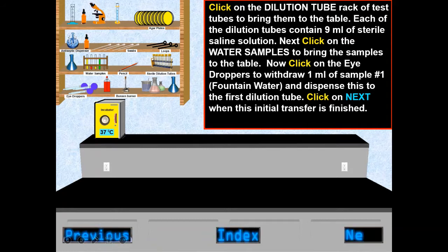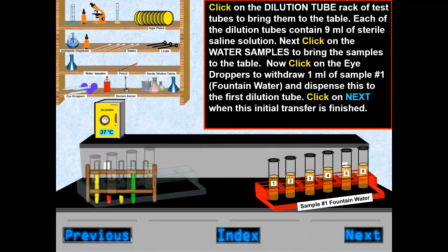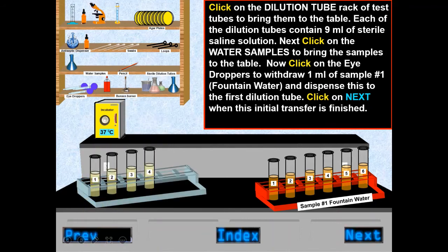First, the dilution tube rack of test tubes was prepared. Each of the dilution tubes contains 9 ml of sterile saline solution. The dilution tubes are used to decrease bacterial concentration with each conducted dilution.